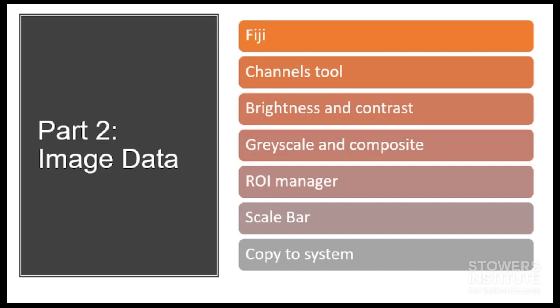We're going to look at some different tools in Fiji, also known as ImageJ, that will help you get your microscopy data into Illustrator. So we'll look at the Channels tool, Brightness and Contrast, Grayscale, Composite Images, the ROI Manager, Scale Bar, and copying to the system so you can get your data into Illustrator.